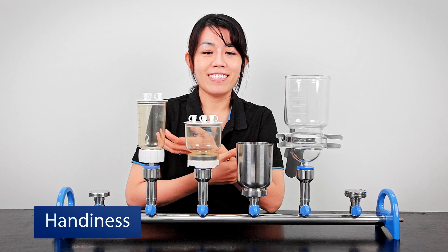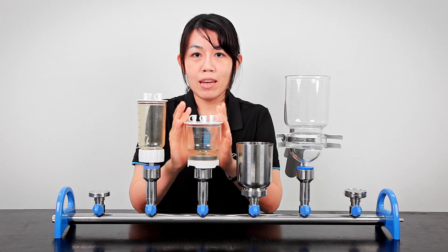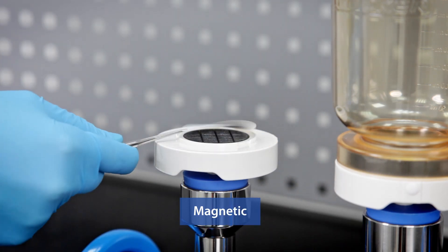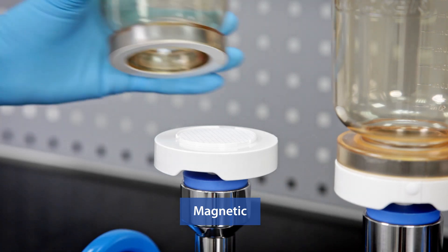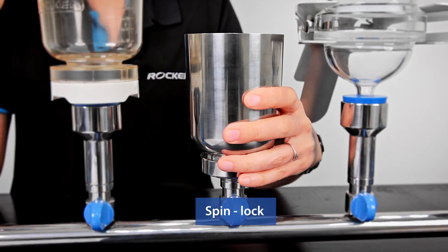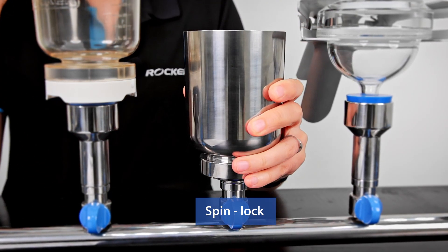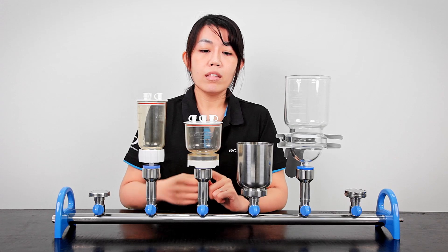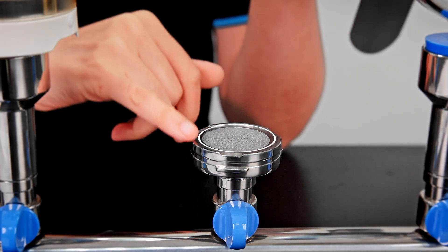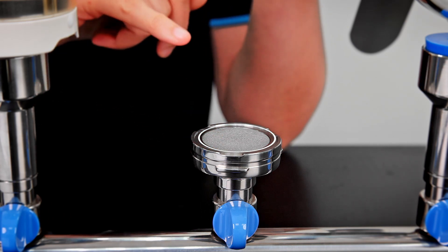Last but not least is handiness, which is a bit subjective. For me, the first place definitely goes to the MF collection — as you can see, you can take it out very easily, replace the filters, and put it back. The procedure is totally smooth. The SF is also very easy to use. With its spin lock, you can take it off with a slight twist, change the filters, and put it back just like this. There's also a membrane guide on the holders that makes it very easy to always place the membranes in the center at the base.